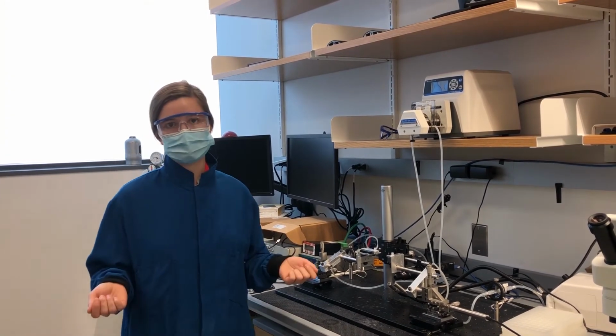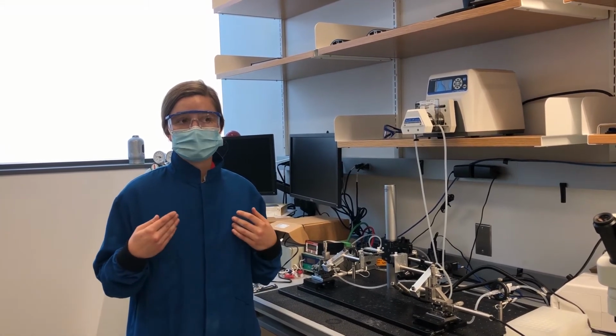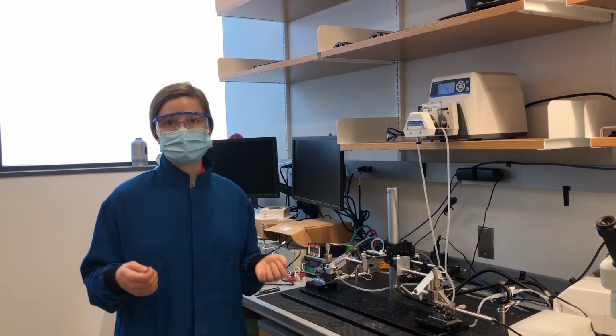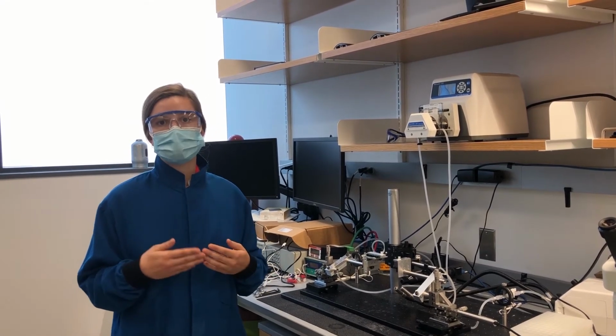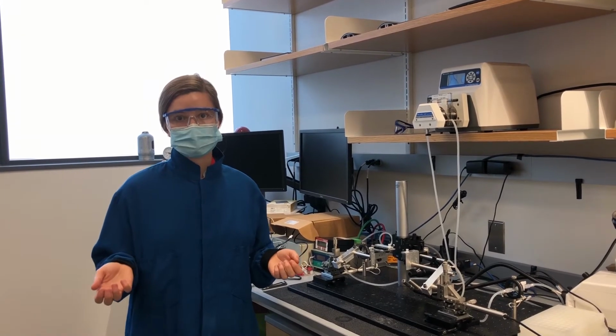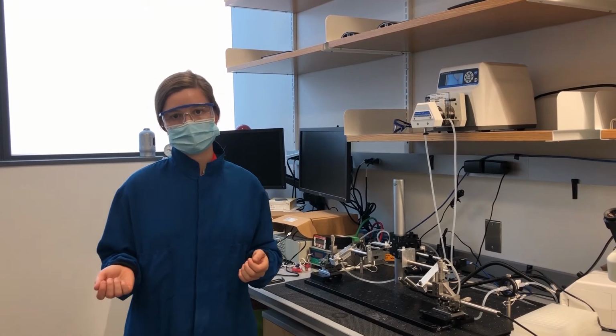And using that experimental data, we can construct computational models that will describe the material behavior of the tissue and help us understand how there may be mechanical alterations to the structure and function of the tissue with these different disease conditions.